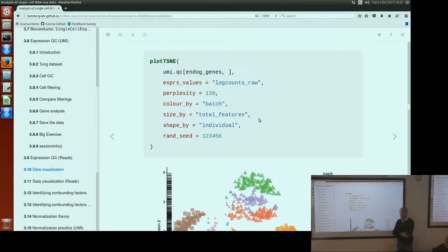Silly question, maybe. What's the function of the random seed? Because if you do set it by default, then it's great. But if you don't, then you can never reproduce your own plot. Yes, because it's stochastic. It's like throwing dice. If you want to reproduce throwing a dice, you need to record every movement on its trajectory, right? If you don't, then next time you throw it, you will get a different result.